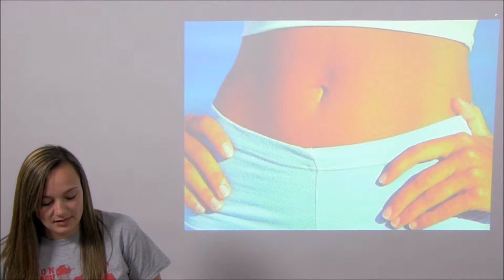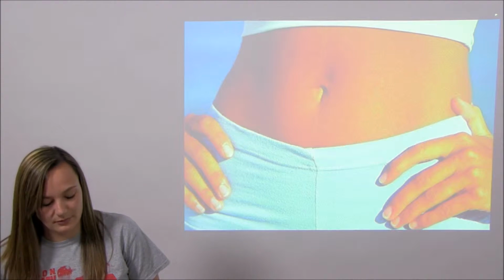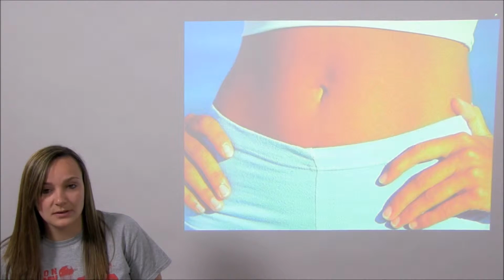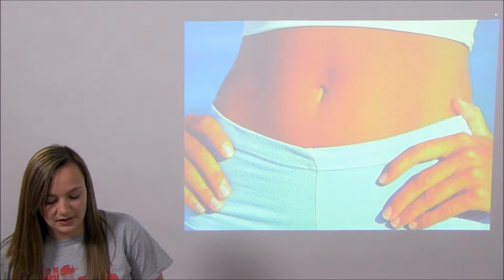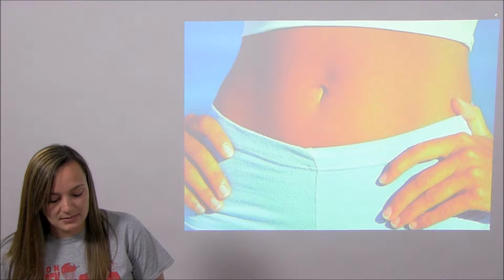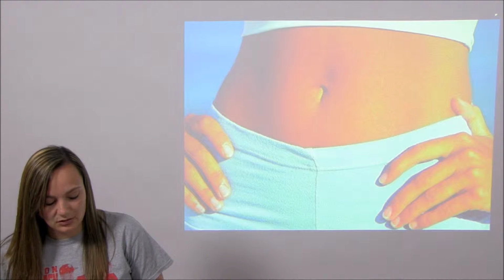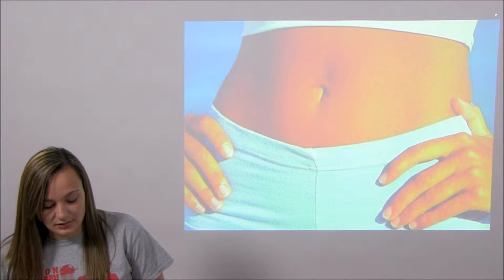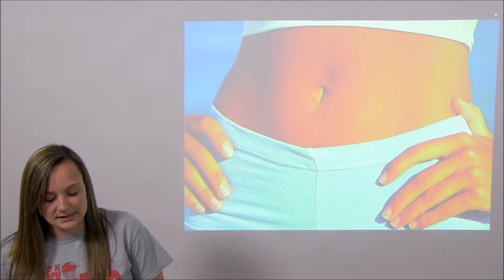The purpose of this lab is to isolate and identify some of the bacteria living inside of the navel. It is necessary to first isolate each individual bacteria in order to run the proper testing needed to identify them. Identification is done by analyzing the various tests performed that separate the bacteria according to the differences and similarities of structure, chemical composition, and metabolic capabilities. These tests include the use of differential stains, differential and selective media, and metabolic tests.